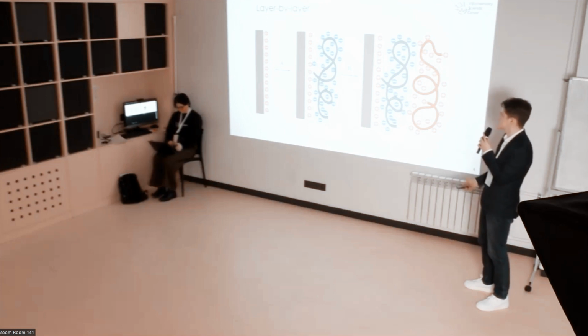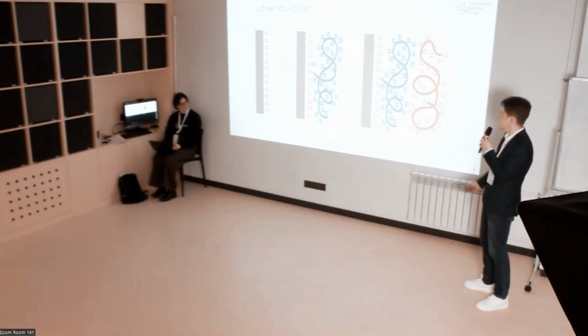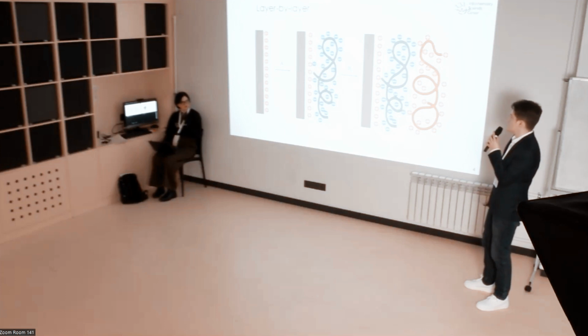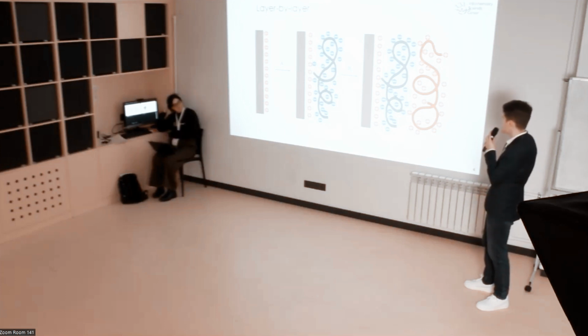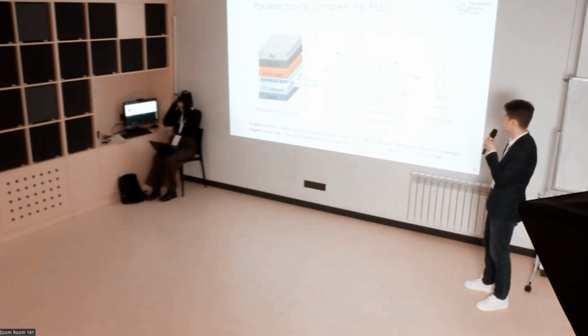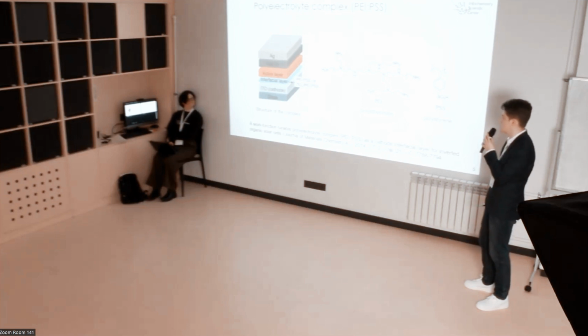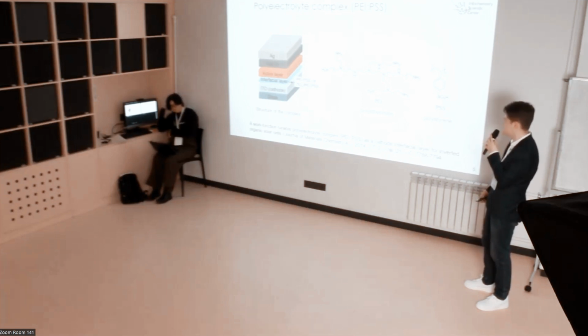Layer-by-layer is a thin film creating technique. Films are formed by depositing oppositely charged materials with a wash between. You can see an example, one of the structures in this work. The usage of a polyelectrolyte complex helped to increase the energy difference.